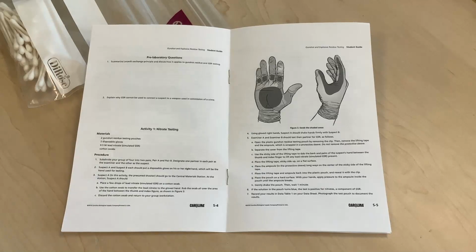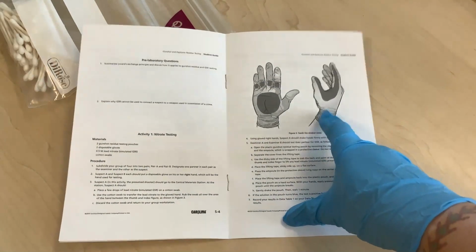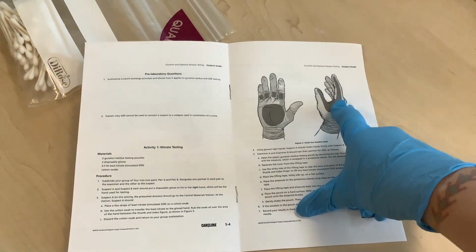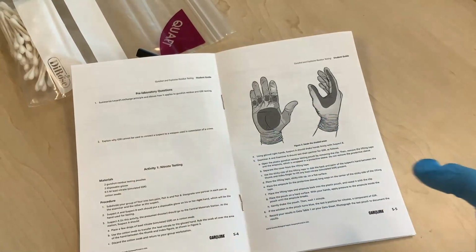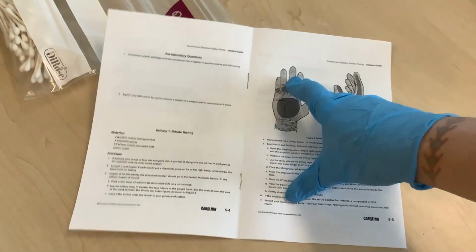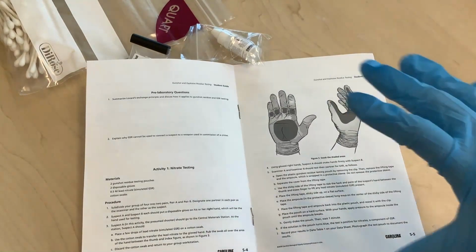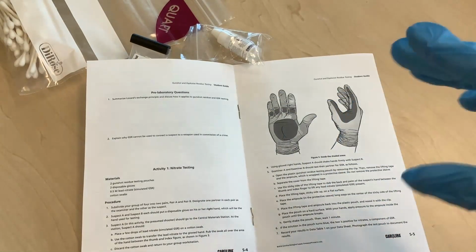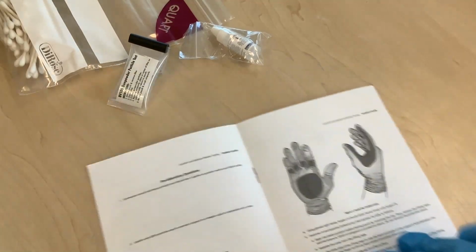So in general, up here at the top, it shows a picture of this glove. The idea is that this over here is your suspect, and you're going to put the nitrate here. They're going to shake hands with the other person, probably getting the nitrates here and across their fingers. So that's the first part of the lab. The second part is that the examiners are going to test for those nitrates.